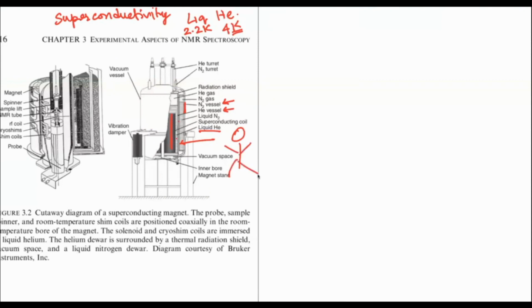Nowadays, these shields are made in such a way that the magnetic field does not affect the person standing nearby. Generally they look for something called a five Gauss line, and nowadays it's very, very close to the magnet, so we don't have to worry. But if you're looking at older magnets, or going for an MRI scan, you have to be very careful about the magnets. You should carry nothing that's magnetic.